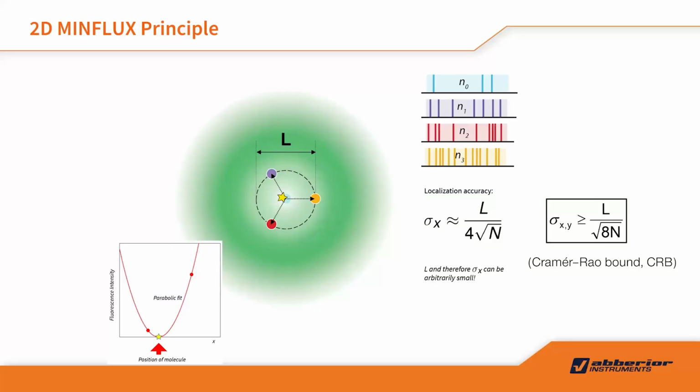We reduce the error from 100, for example, to 80. Then we set the accuracy from 10 nanometer, let's say, to 7 nanometer. Then you calculate the required signal photon numbers. If you meet that condition, you can do the further iteration to reduce the error, to set the accuracy even higher. Then normally after 4 or 5 iterations in our system, you will always reach around 2 nanometer localization precision. That's the whole idea behind MINFLUX. And actually, it's automated. It's a turnkey solution. You do nothing about all the steps I described.